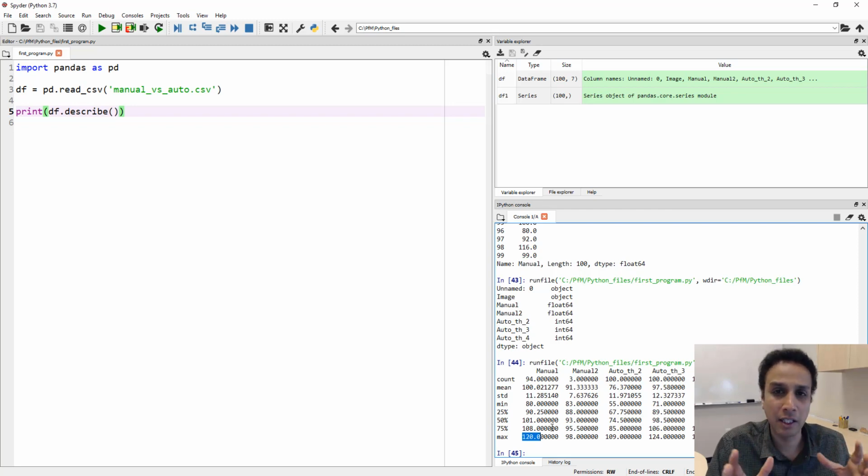This gives a great overview, especially if you're looking at data from images. You can look at what the minimum pixel value is, the maximum, what the standard deviation is, and all of that, or for objects that you have segmented. It doesn't matter. Describe gives a great overview of the data set you're dealing with.